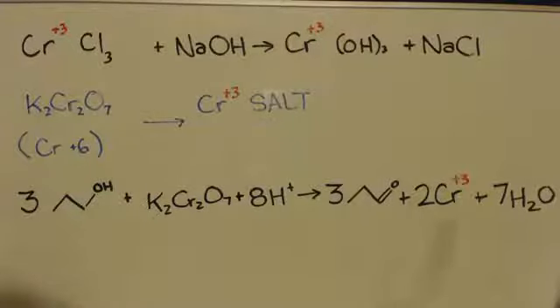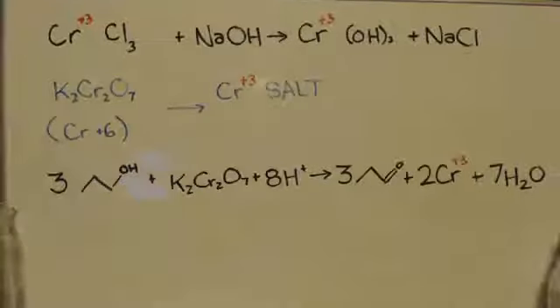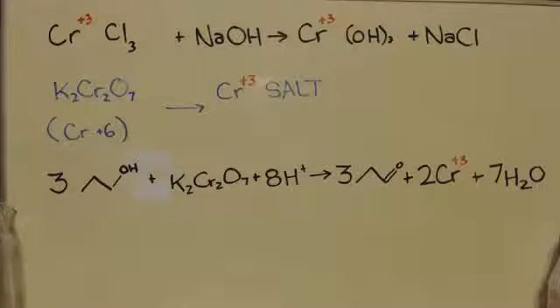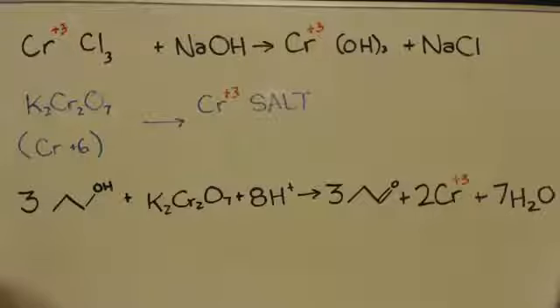Now think about this after you're done with this reaction, right? Most likely you're going to use some baking soda, sodium bicarbonate, okay, to neutralize any sulfuric acid that's in the reaction over here, like when you're done. Okay, now that cation, the metal cation, is only sodium, so that's no problem.